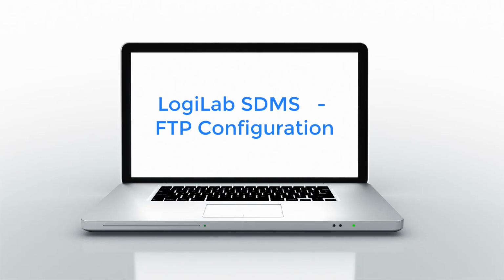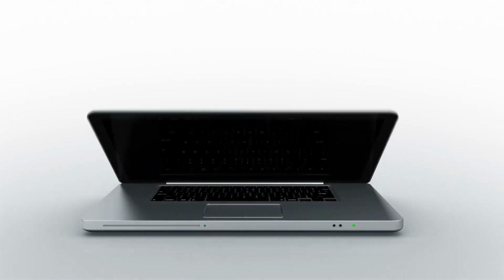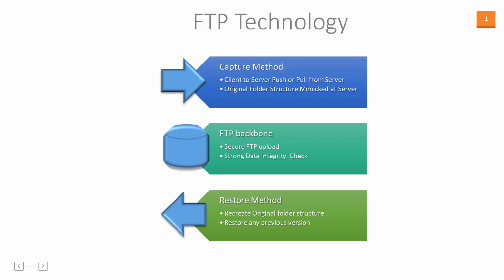Welcome to Logilab SDMS FTP Configuration. In this video, we'll be seeing how the FTP can be configured in the SDMS application.